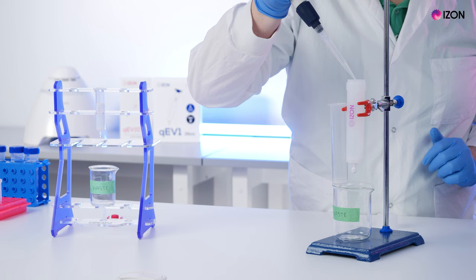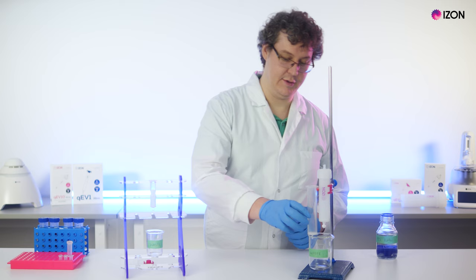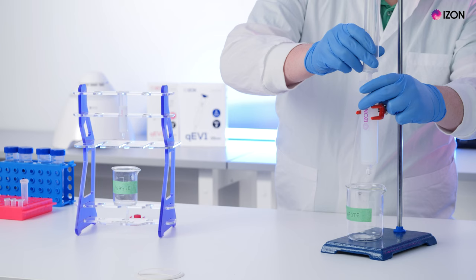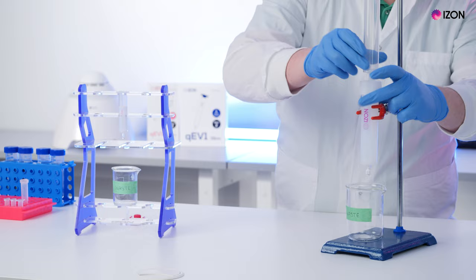If there is any air, top the connector up with buffer so that there is a small volume of buffer on top of the column connector. Connect the reservoir to the upper junction cap firmly.